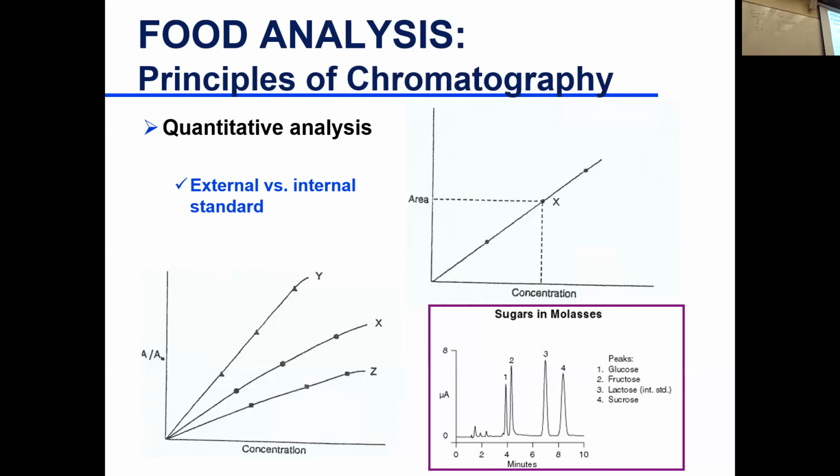But if we were to, we would have maybe something like C4. You would add it to your oil, and then you would do the whole sample prep. And then you would have an external standard. For every fatty acid, you would have the standard for it and run the standard for it, which you didn't do.